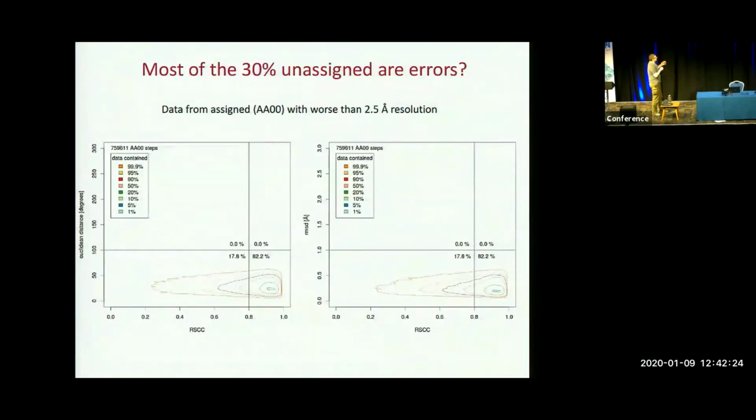So as some kind of internal proof or validation of it, we are also plotting the same for RMSD with respect to the best representative of the class. Again, the RMSDs are relatively small. Here, this kind of tail shows that the conformations are correct there. It is really nicely looking A geometry, but it's not really supported by data. In this low resolution, it's around 20%.